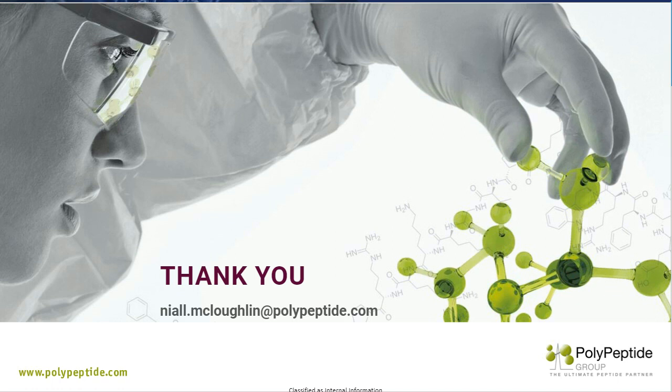Basically, if we see that certain beads are stained, then it means that the coupling is not fully complete. And if we see an absence of the stain, then we know that the coupling is within 99.5% completion. It's a colorimetric test, so we don't have absolute quantification, but it is very reliable and it works very well for us. So this is how we test the coupling completion. I hope that answers the question.